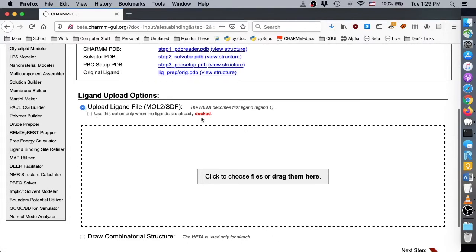If your structures are not pre-docked, CharmGUI will attempt to position the ligands for you. Note that the positioning is based on the selected residue, toluene in this case. Thus, if you upload ligands with a very different structure, the positioning may be less accurate.